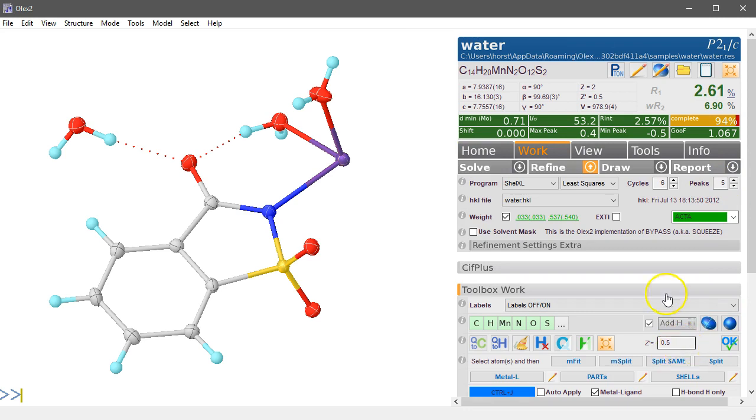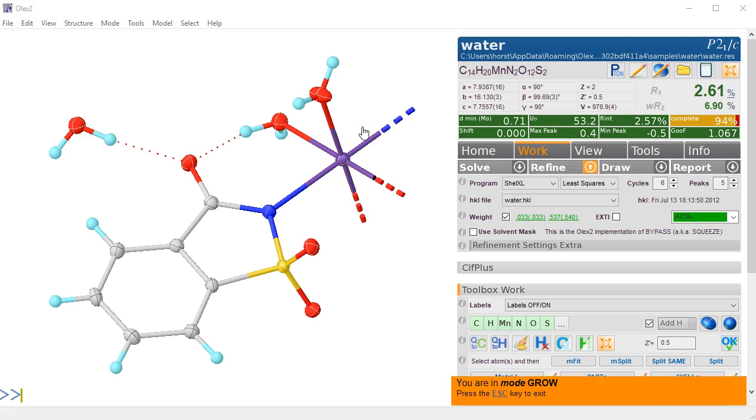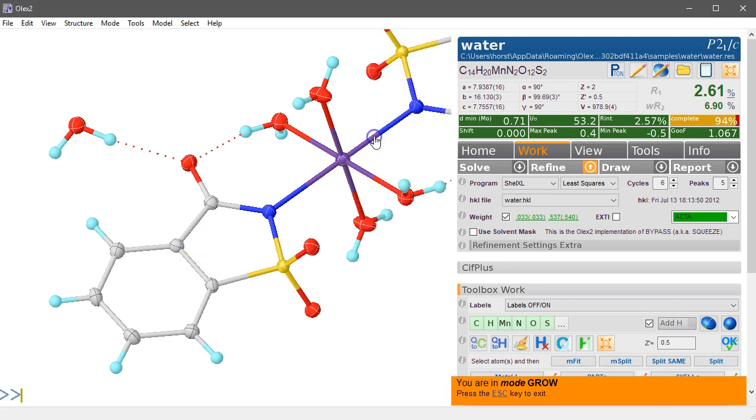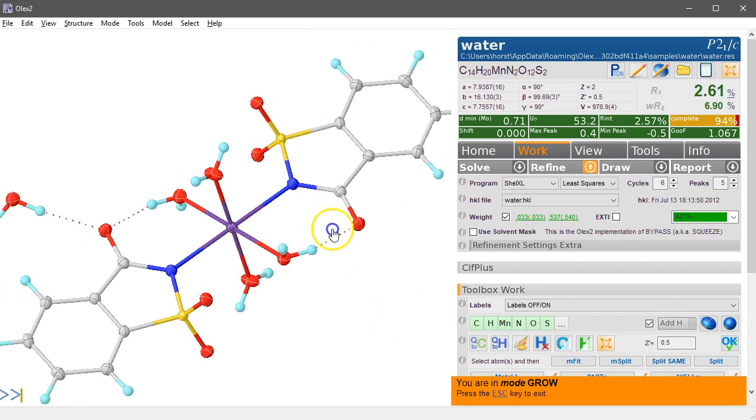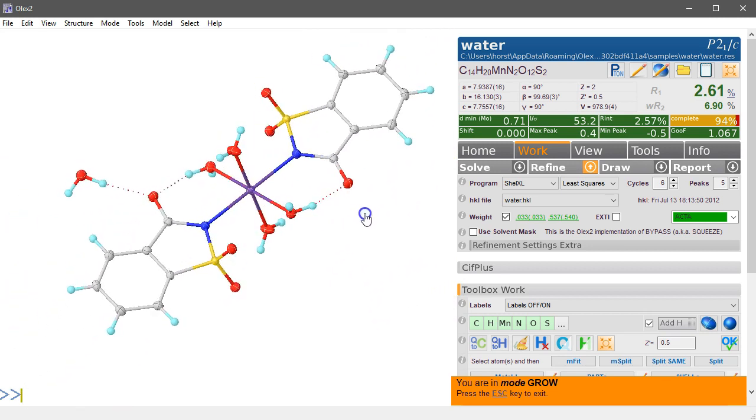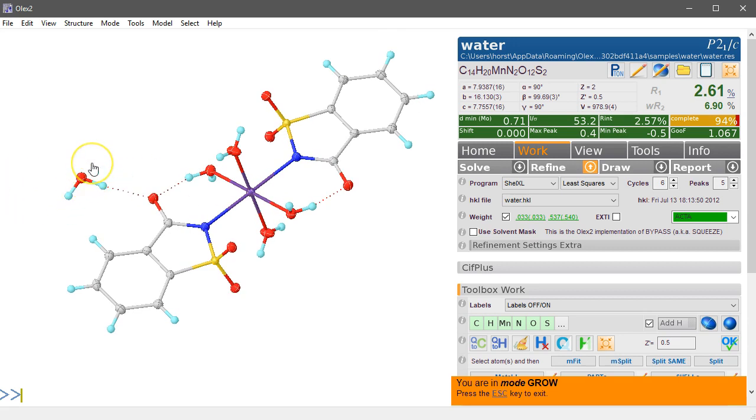So what that means is this needs to be grown to see the full thing. So Ctrl G shows you where it can grow. And you can click on that. And we don't resize this automatically. You need to do this by hand. Also, what it hasn't grown is this extra water molecule. This needs the command grow minus W to show everything that is there.